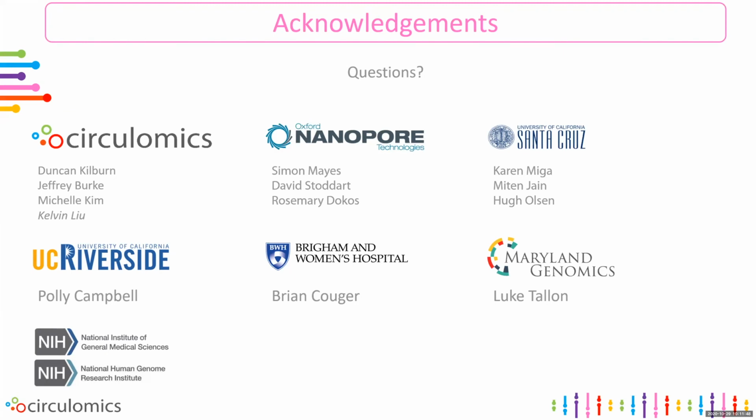So let's see, we have time for a few more questions here. What is the Nanobind purification efficiency? I guess that question is probably asking for the recovery efficiency. I'm not sure if they're asking for that in the library prep or in the extractions themselves. Maybe you could address both. Yeah, so in the extractions themselves, we think they're generally quite high, greater than 80%. So we should be getting back most of the DNA that's in there.